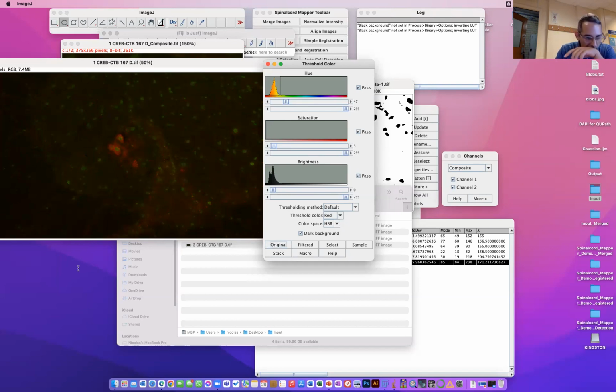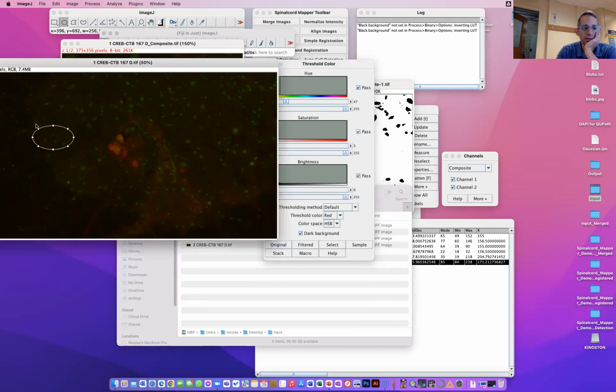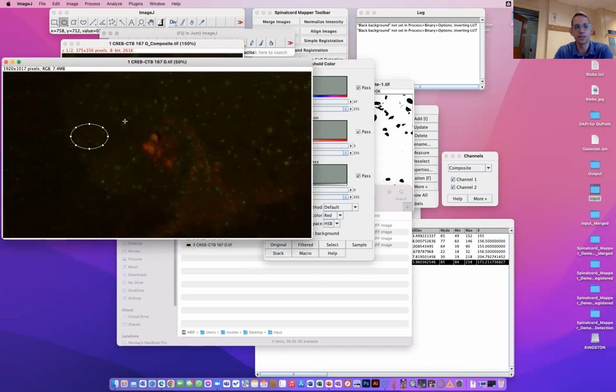Any question in the chat? Merci. In this case, don't we have to subtract the green and red backgrounds before evaluating the density of selective labeling? In the case of Islay, you want to subtract the green and the red background? Yes, we can. Before evaluating the density. You mean that this tissue around here contributes to the fluorescence you have here? Yes, this is a very good point, and this is true.